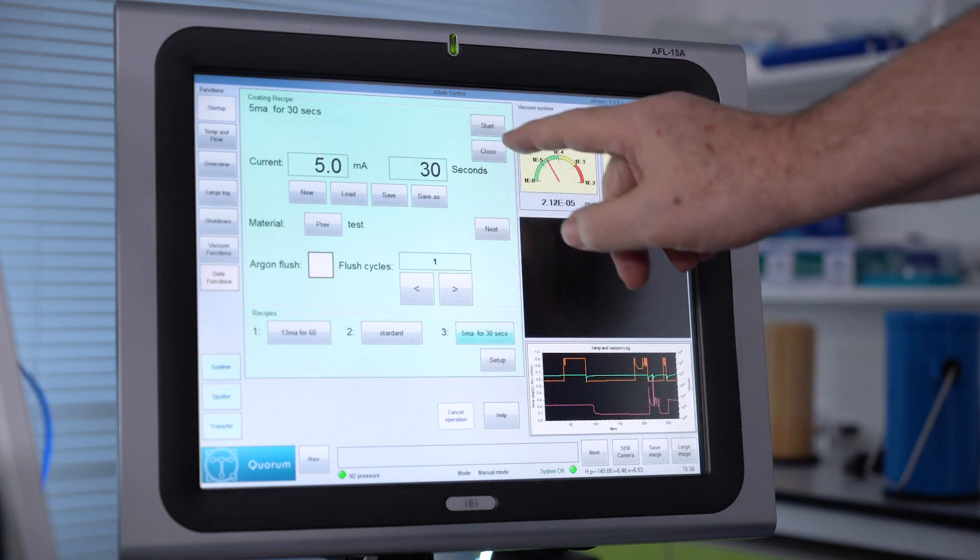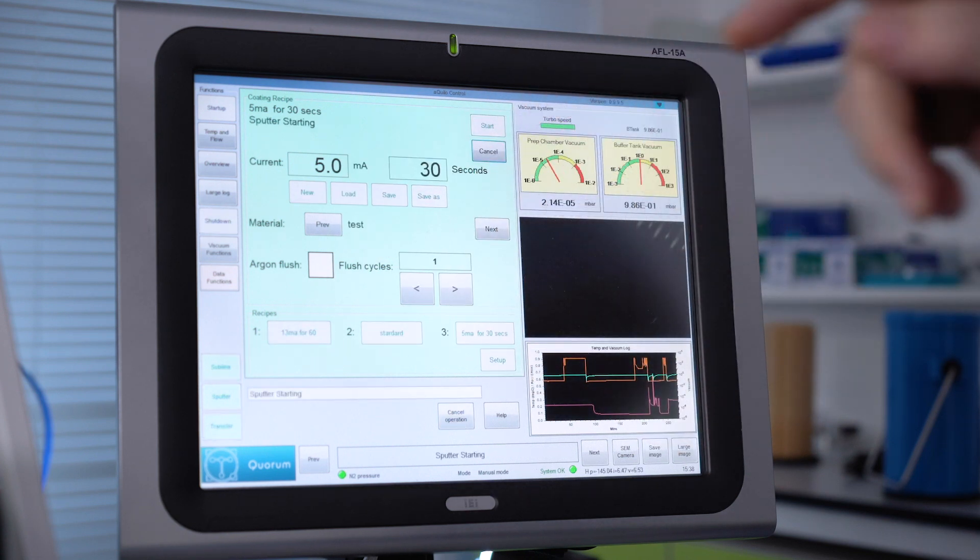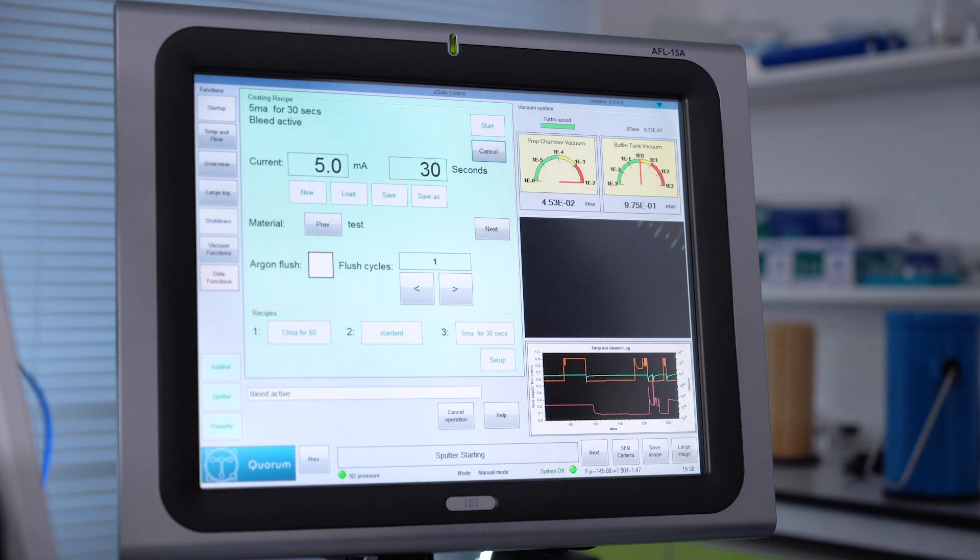When we're happy with the parameters, we just have to press start and then the coating happens fully automatically.